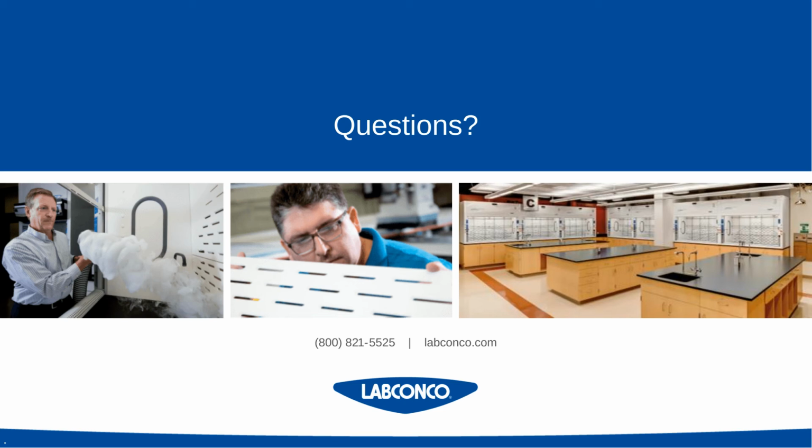So I chose 60 feet per minute because that's the standard that we've been provided that is required of a high-performance fume hood. To be considered a high-performance fume hood, you need to perform at a really high level on an ASHRAE test at 60 feet per minute. So those hoods are proven to have excellent containment down there.